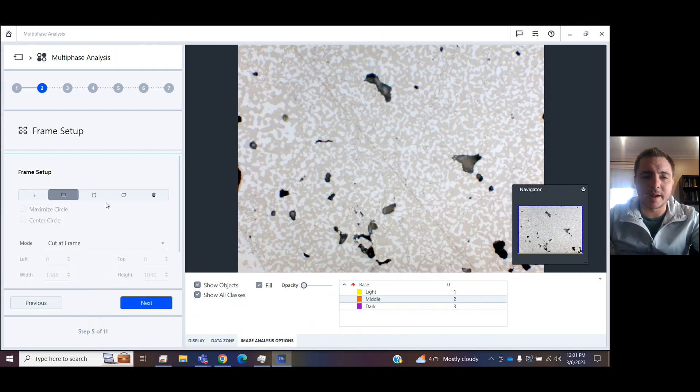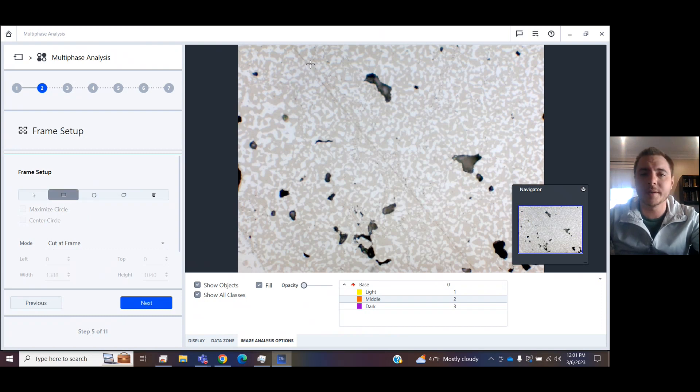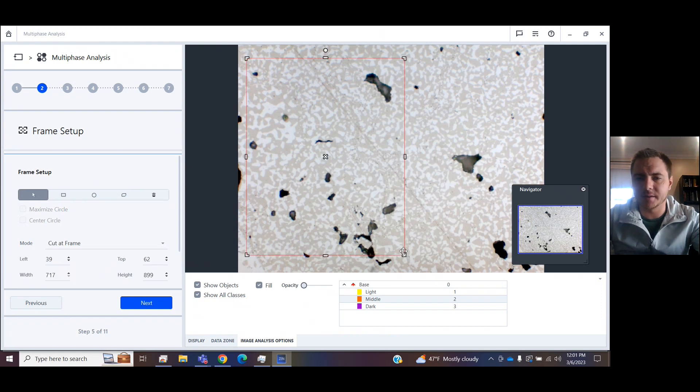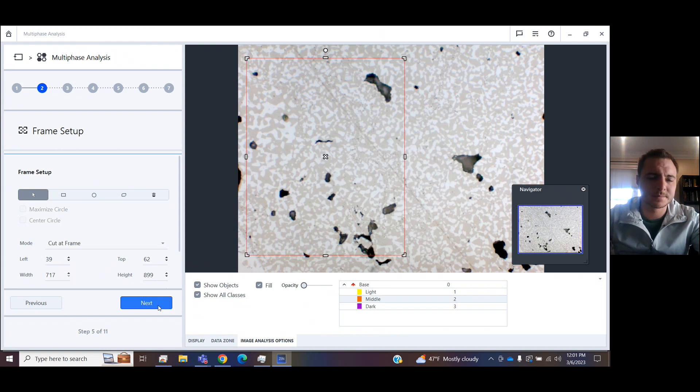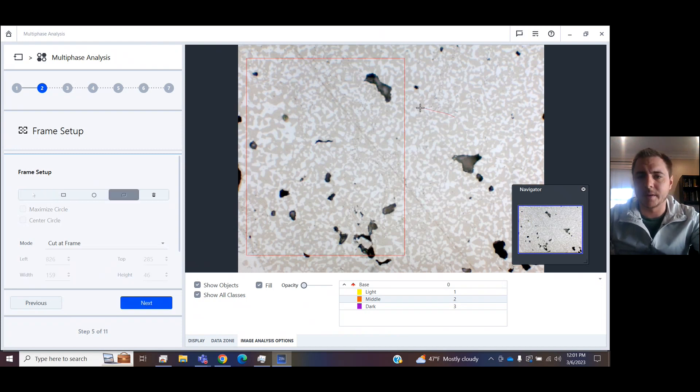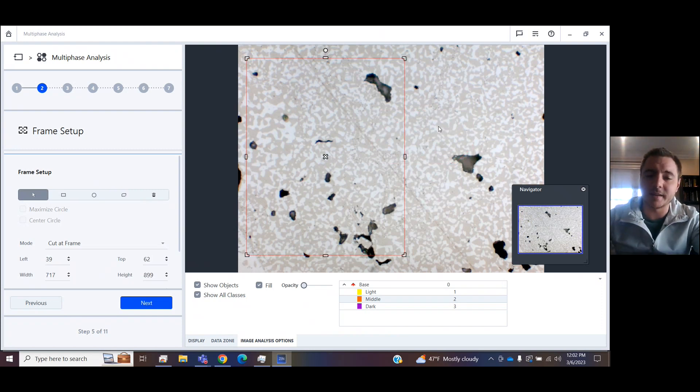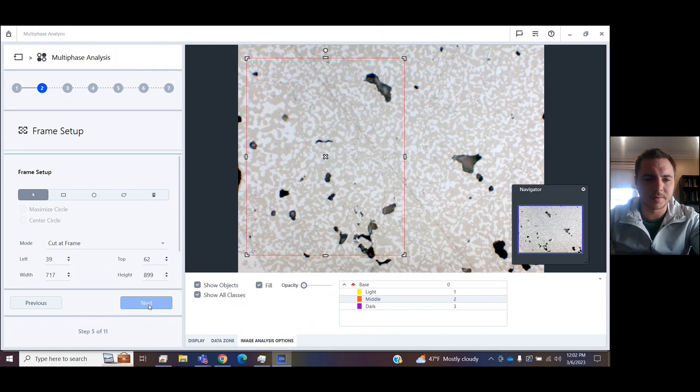Moving on, we have the frame setup. So in here, you can choose to analyze the whole image, or you could draw a frame. So we could just say, let's analyze in this section here, that's what's important to us. You could also draw a polygon or a circle, whatever it is that identifies the area you want to measure most.